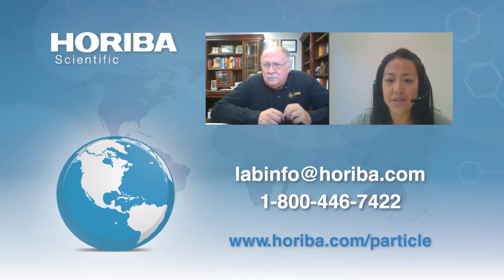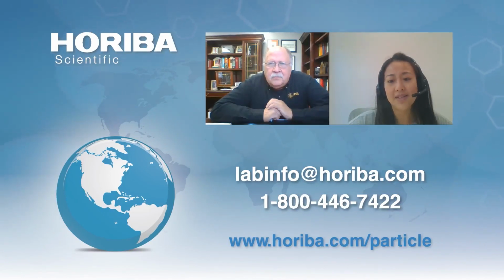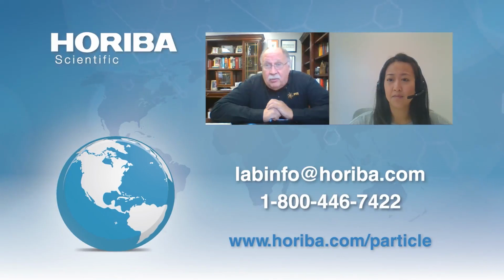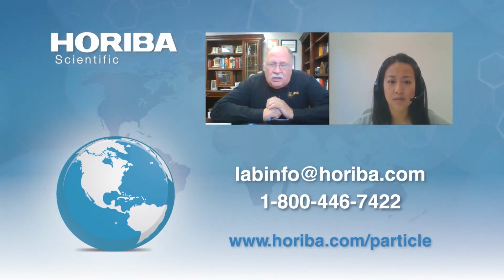Thank you. That leads me to the question that came in during registration: what different techniques and instrumentation does AVEKA carry? Well, I had a list of that, but we have lots of HORIBA instruments. We love that, but we also have the Coulter counters, the cam sizers, the SEM, the digital optical microscopes, the QA DSCs and TGAs. We do surface area measurements, lots of moisture balances, OHAUS and Karl Fischer water measurements.